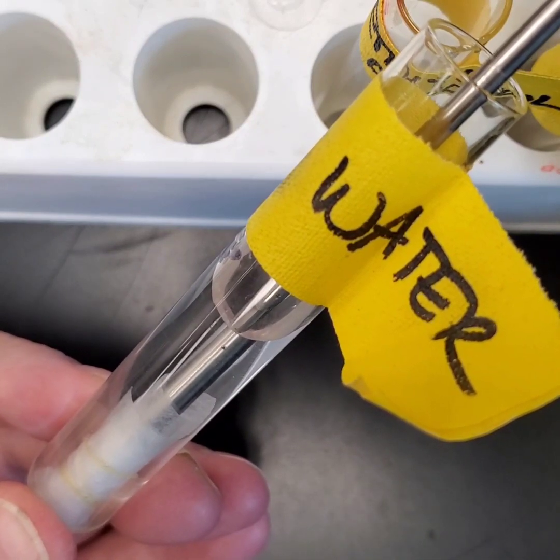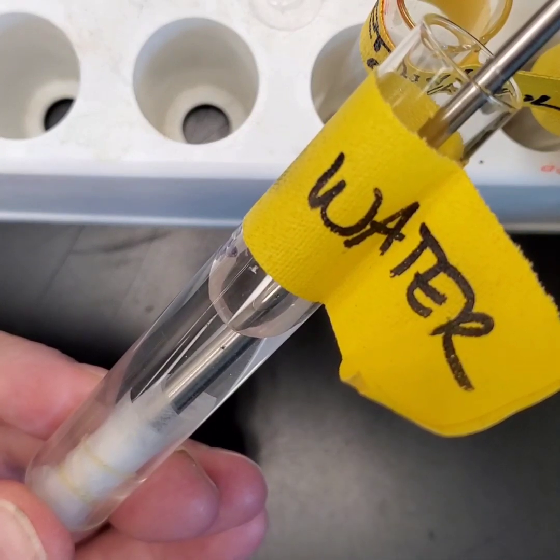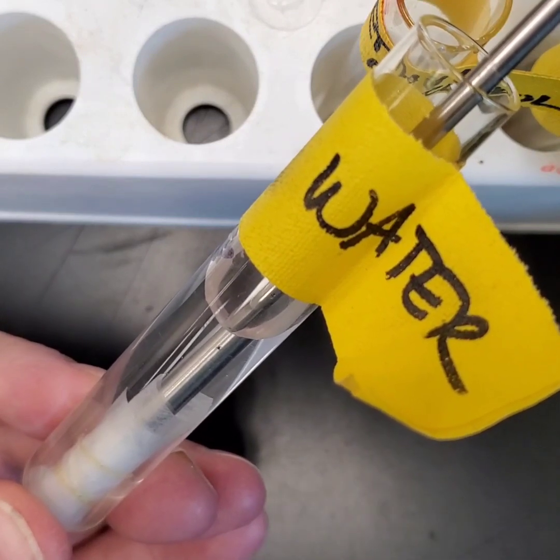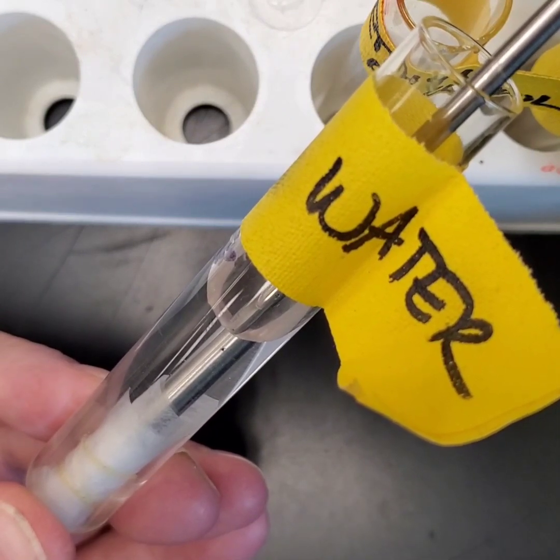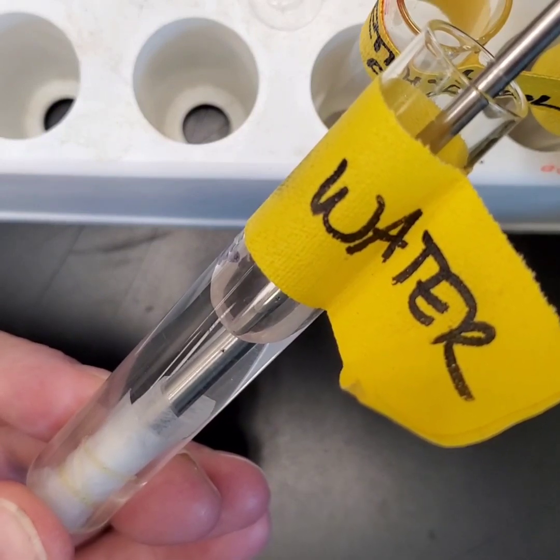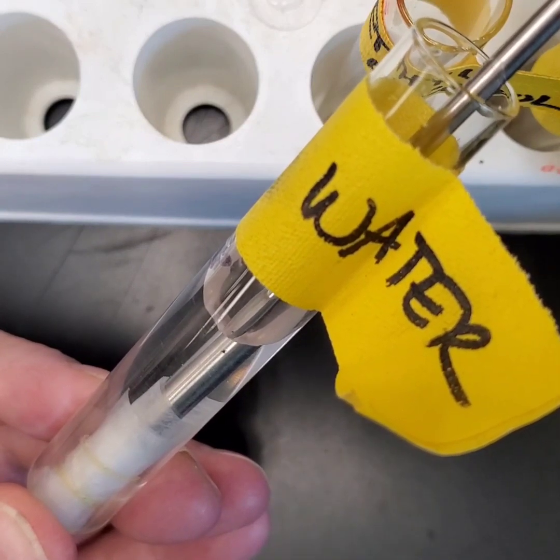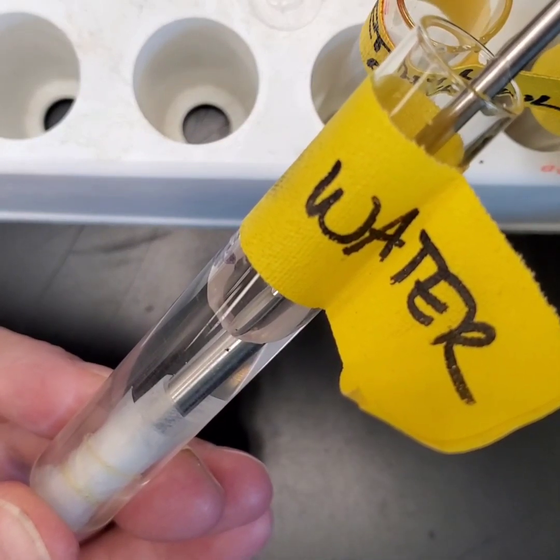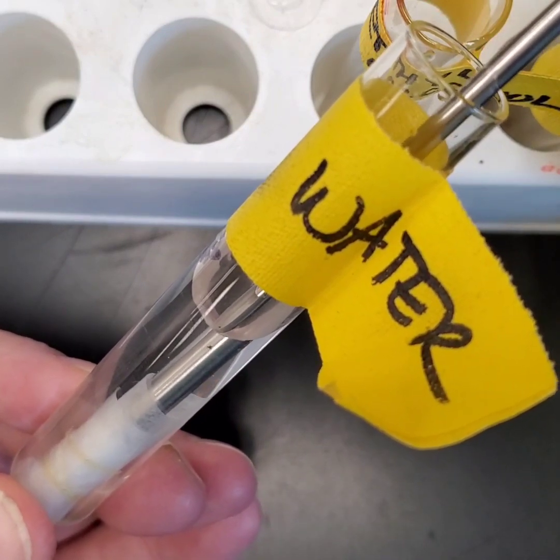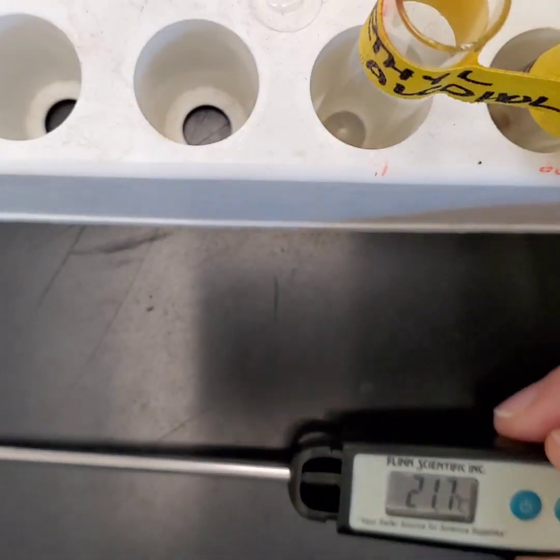You are then going to record the temperature every 30 seconds until I say stop. We're going to look at the temperature drop until it stops changing, until the temperature goes up, or until a total of 8 minutes. I'm not going to do the recording for you, so maybe have a stopwatch or a clock, or you can look at the time stamp on the video. But every 30 seconds, you're going to take the temperature. All right, so I'm going to pull it out. Go.